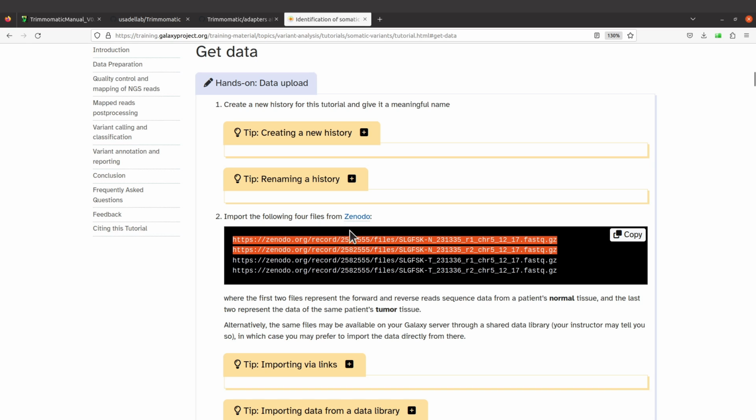Of course, if you have the ebook and the bash script, you can always modify the script and use different data. That's fine. I'll need these links, and I'll download them one by one. I'll copy this first, and then I'll move to the terminal. You can also download by clicking if you're using your browser, but I will do everything on the terminal.